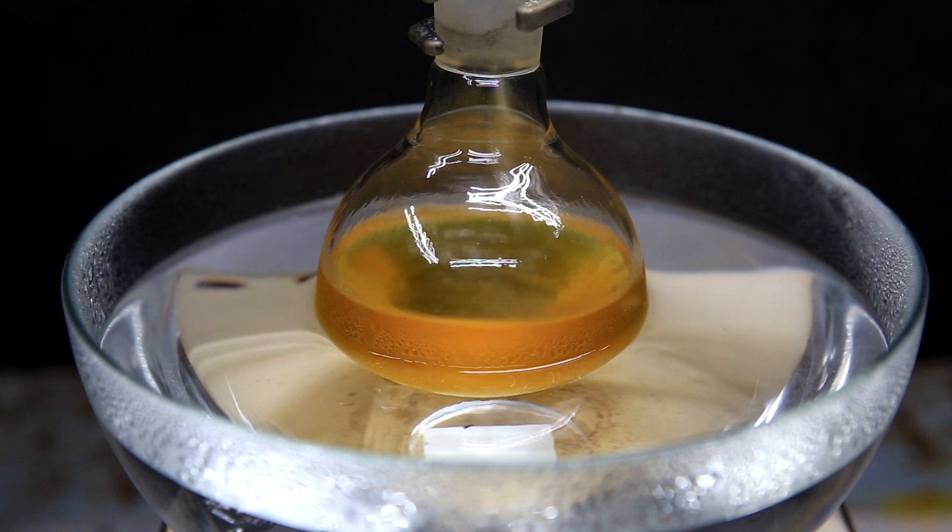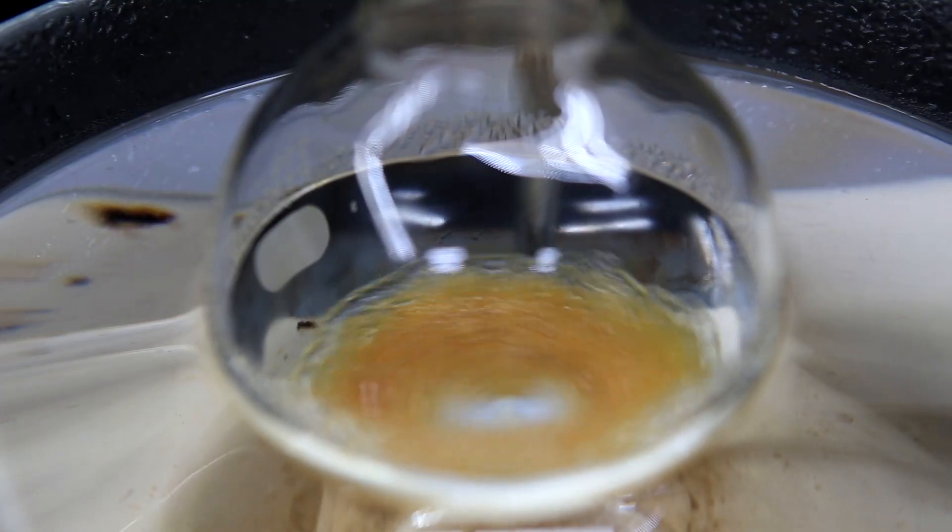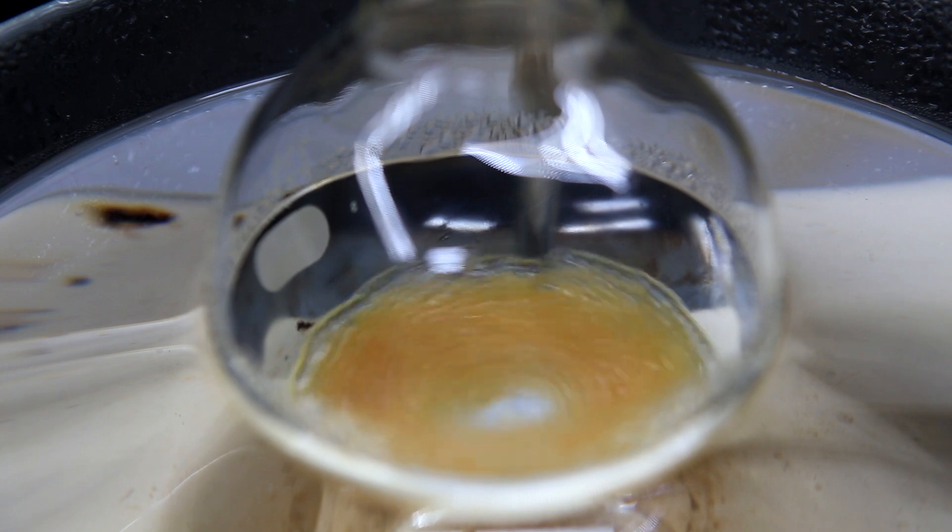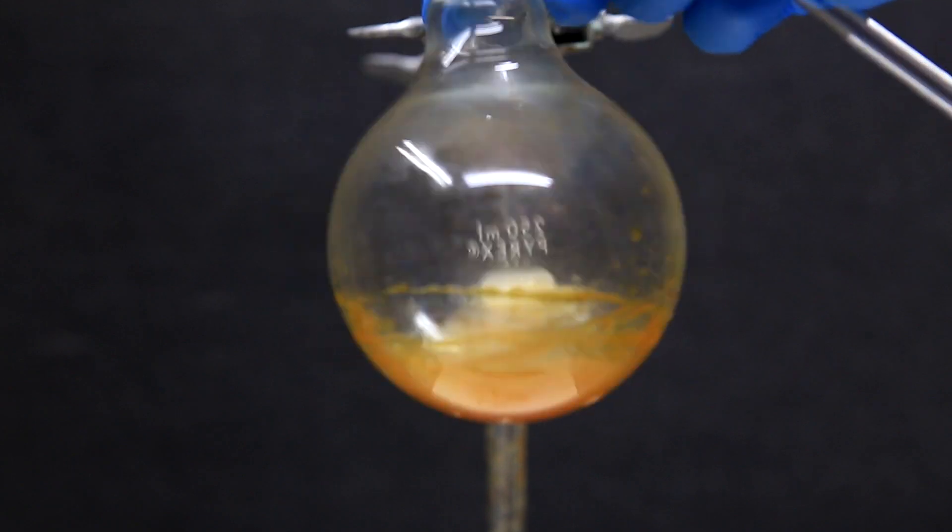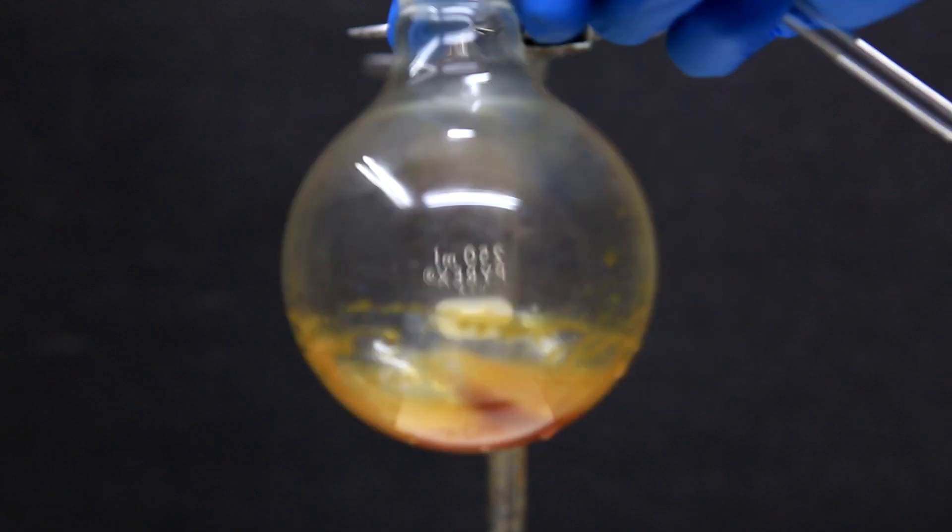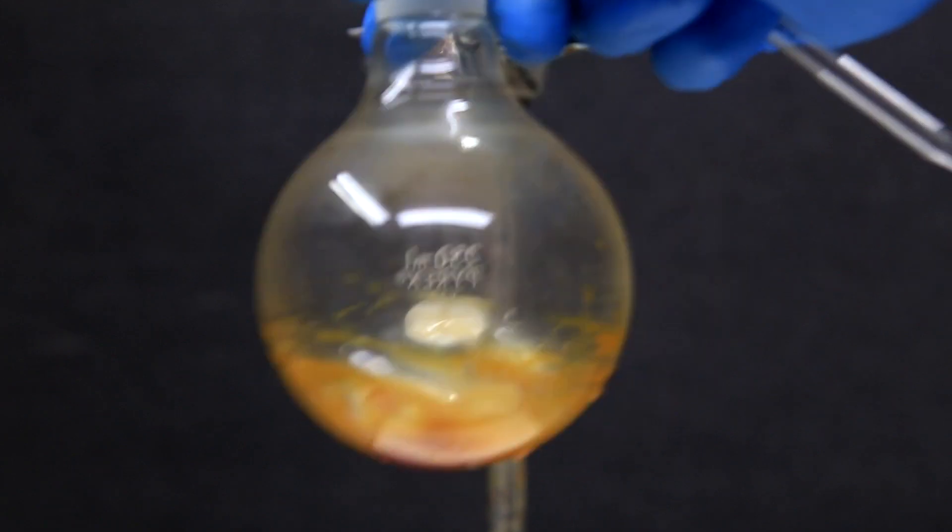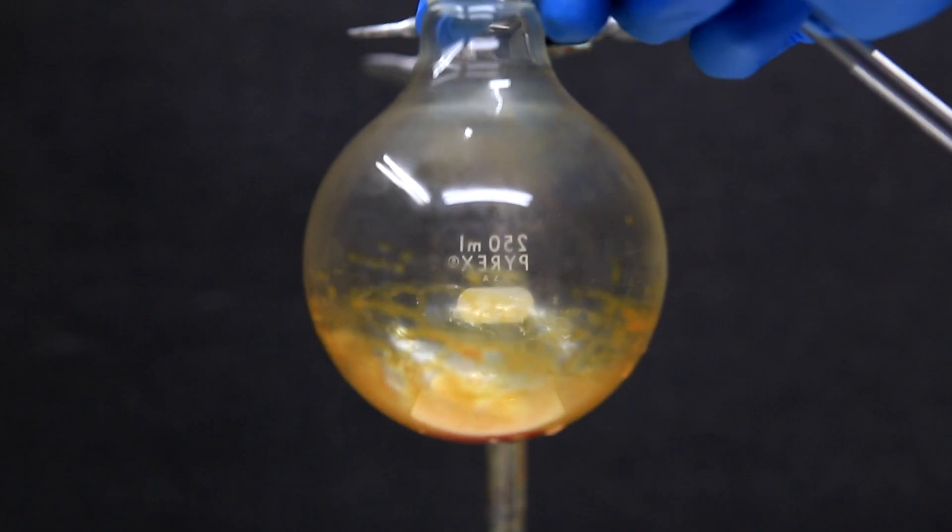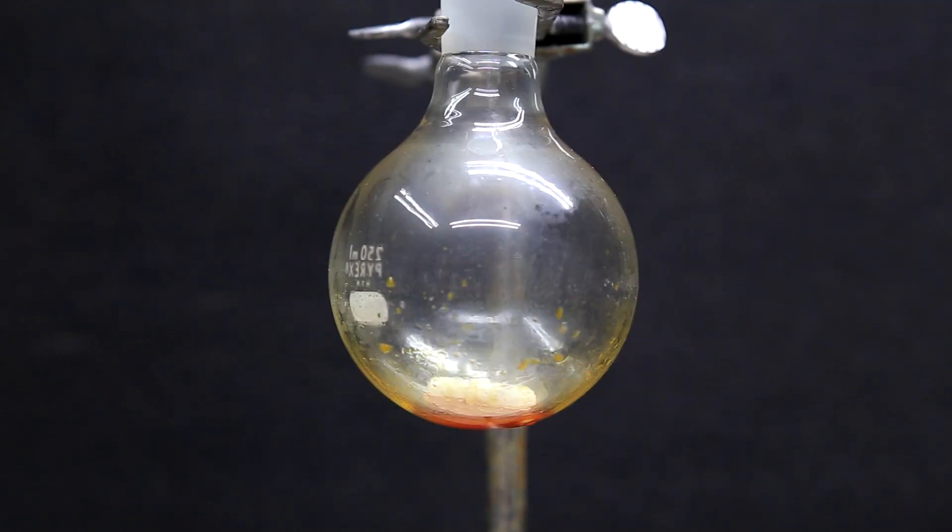I then set up a distillation to isolate our beautiful freebase. After like 30 minutes, we're left with very little DCM and we're very close to getting our freebase. Something about 10 minutes later, the distillation is done and you can see a nice red oil at the bottom. When I shake the flask around, the stuff sticks to the side and we can see that we indeed do have an oil.